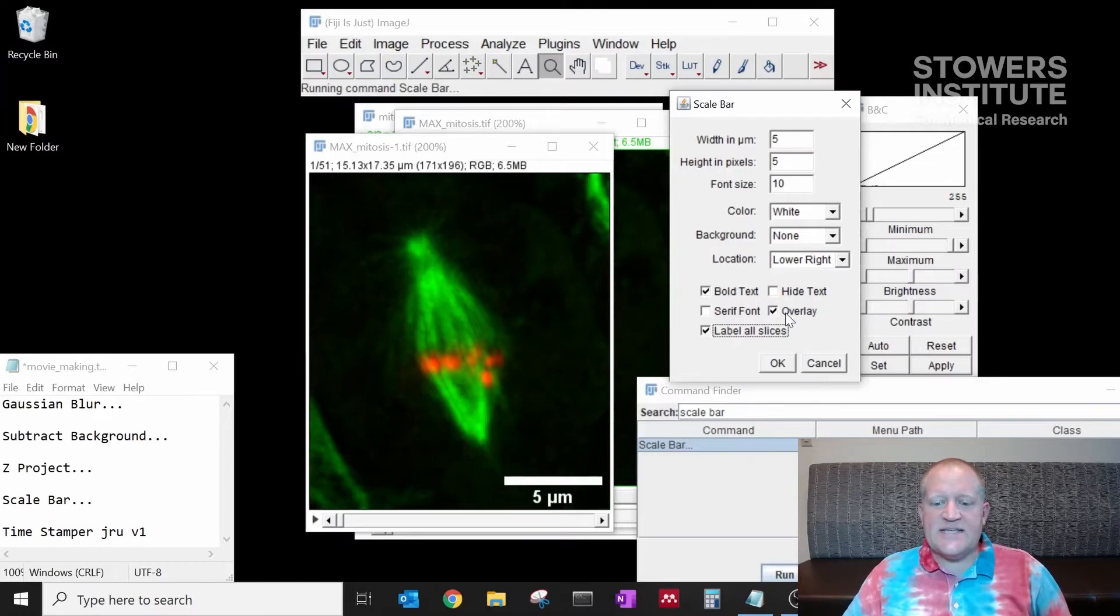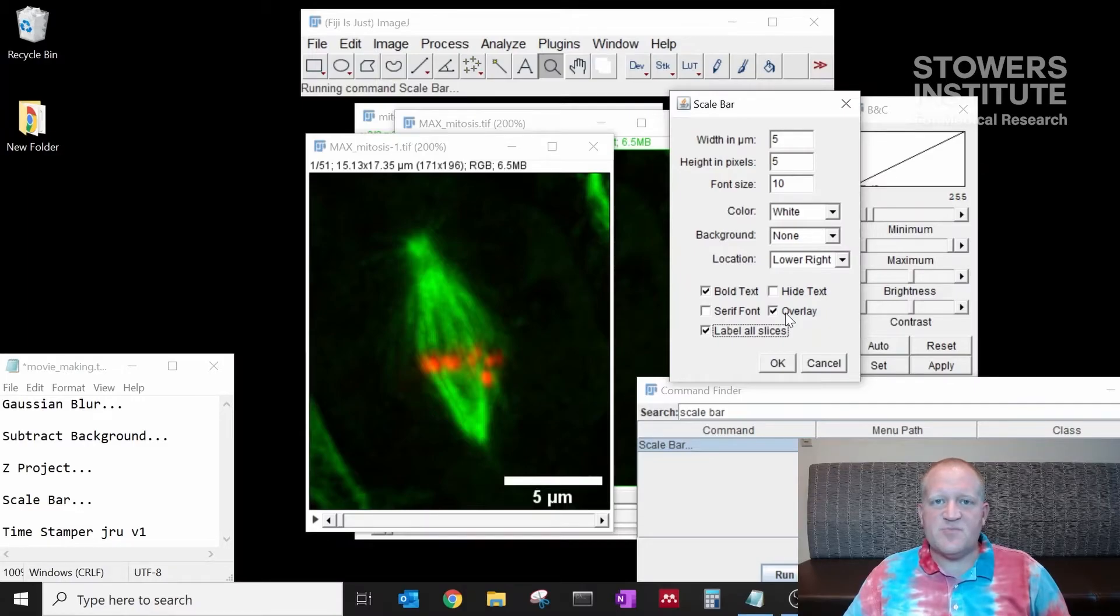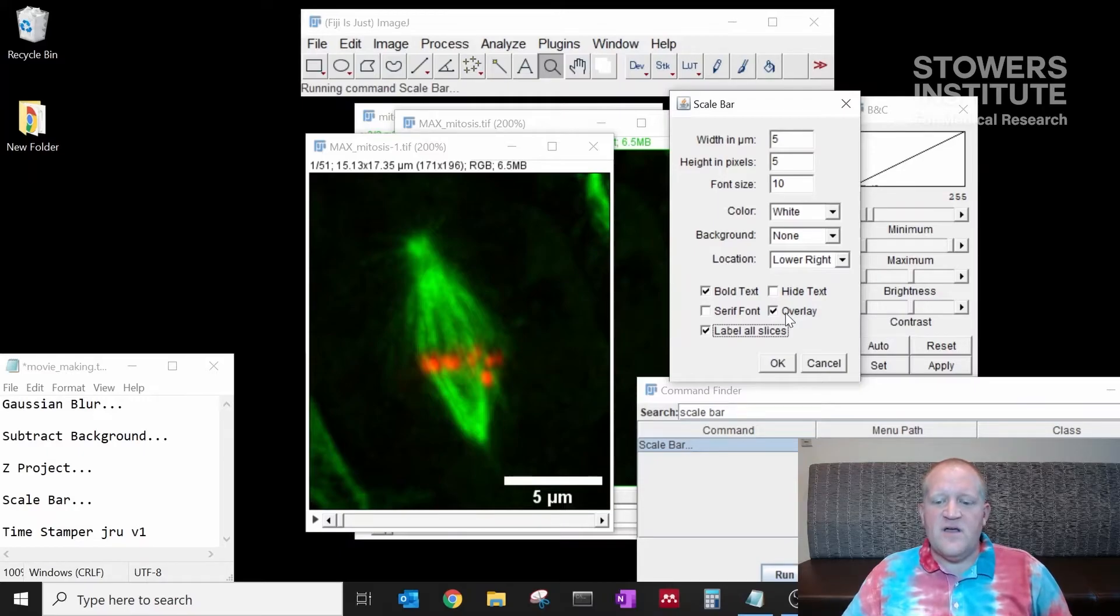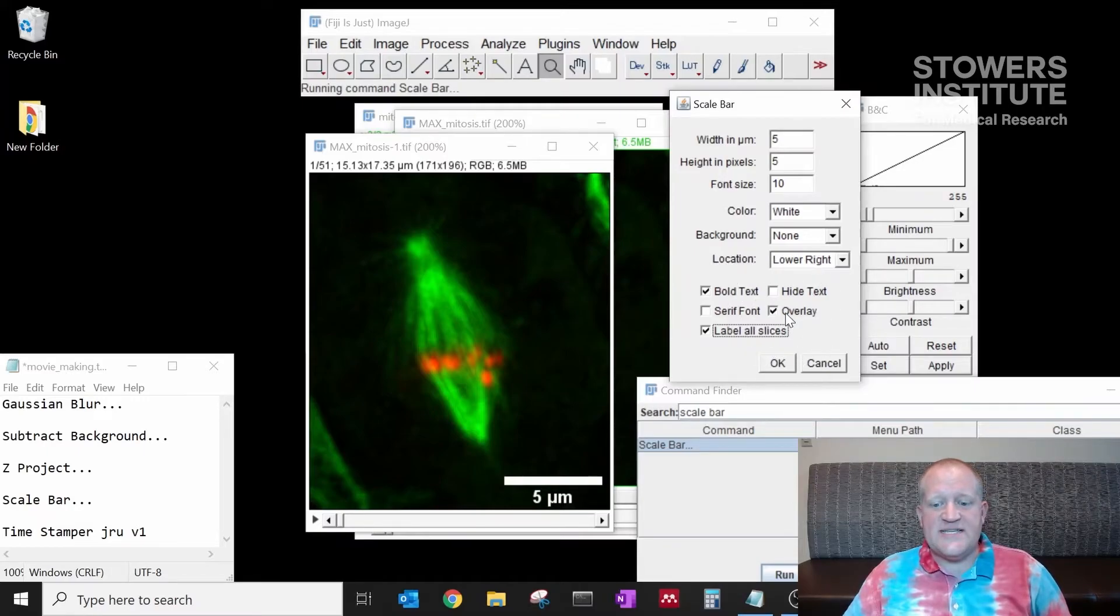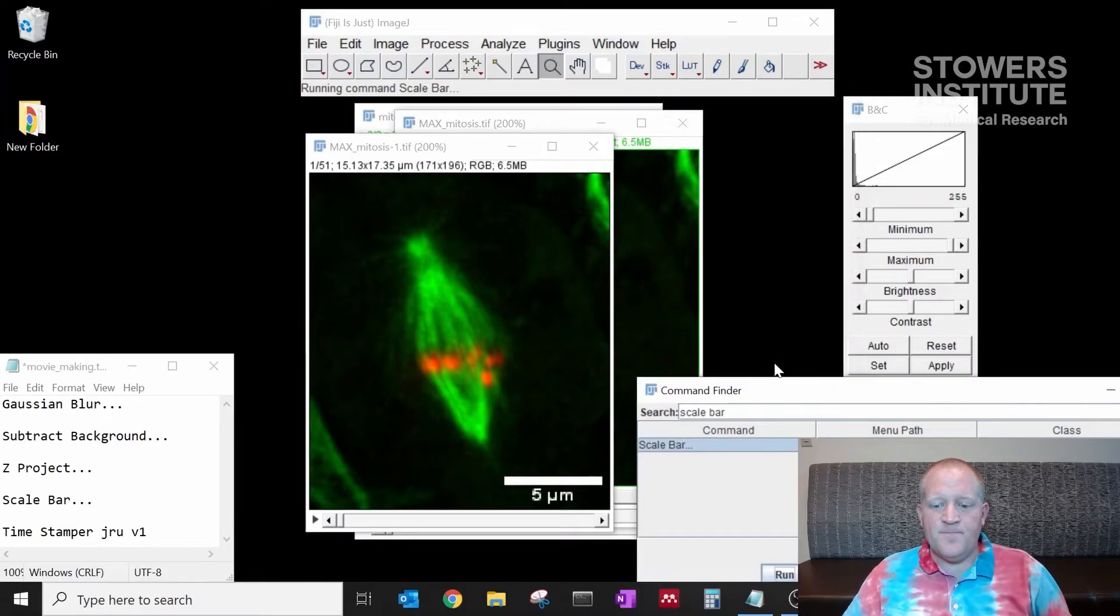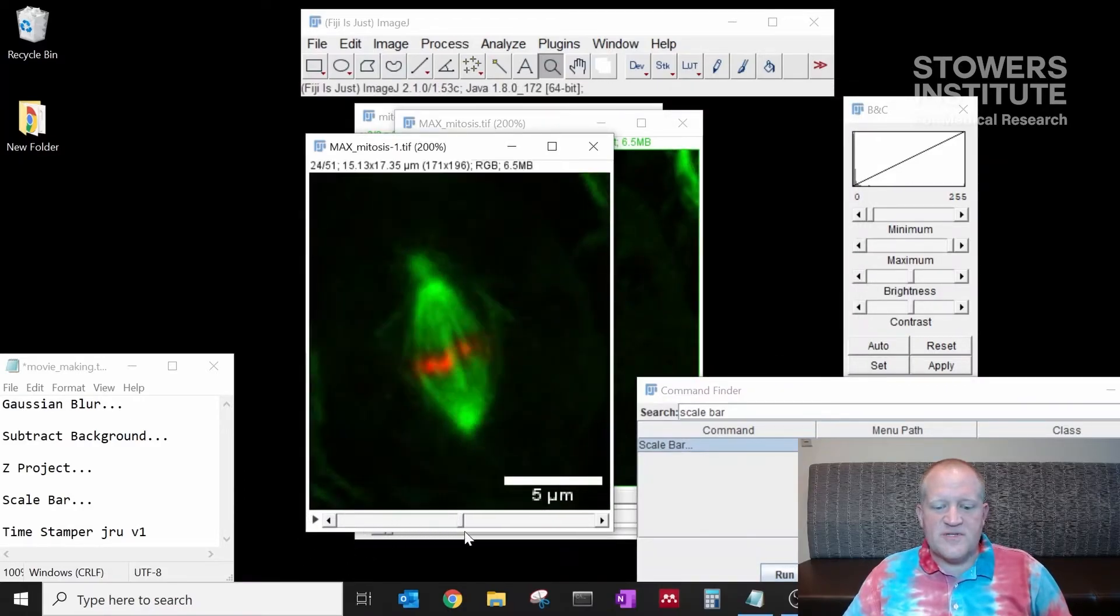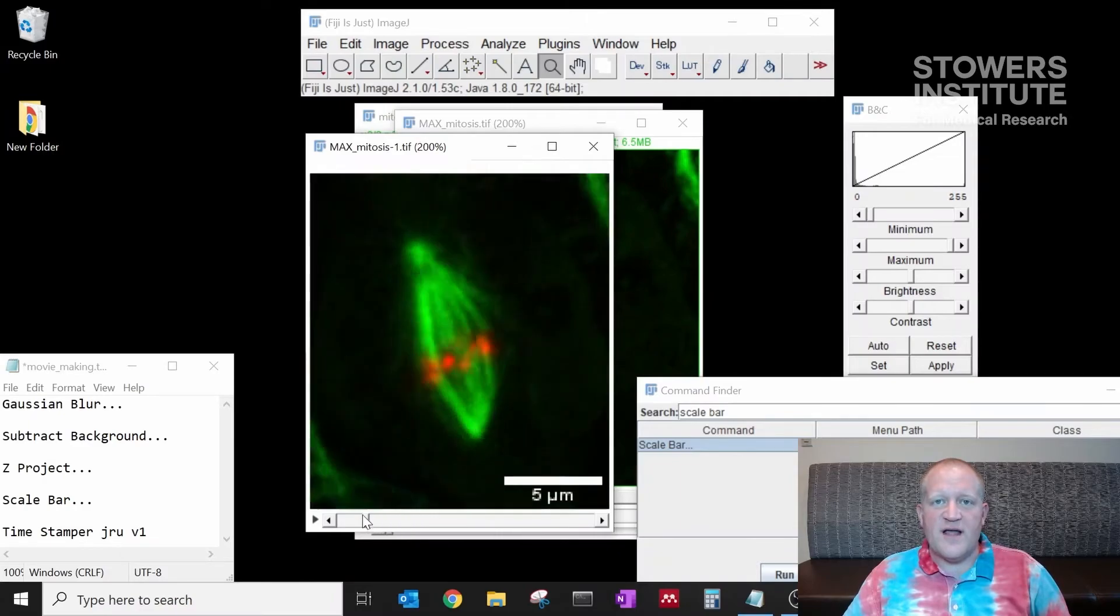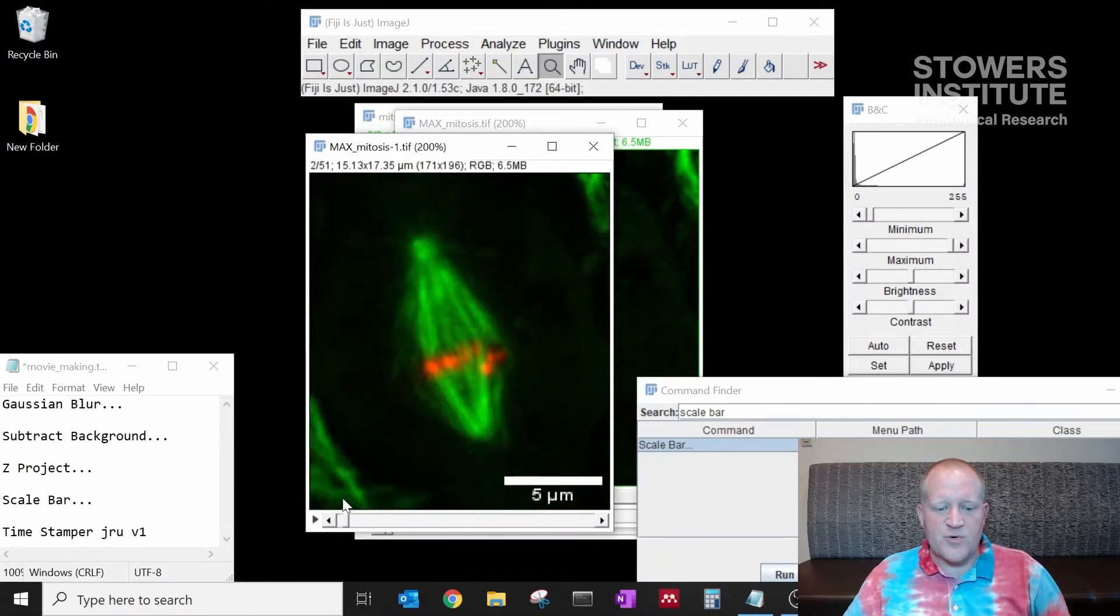I'm going to select label all slices. And the last thing is I'm going to deselect overlay. Overlay is a way where Fiji can display things over the top of the image, but it's not actually written onto the data itself. So for other programs outside of Fiji to recognize the scale bar, we want to deselect overlay. Once we've done that, I'm going to click OK. And now our data set, if we scroll through in time here, has that same scale bar on every frame of the entire movie.